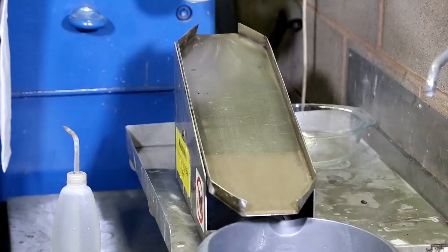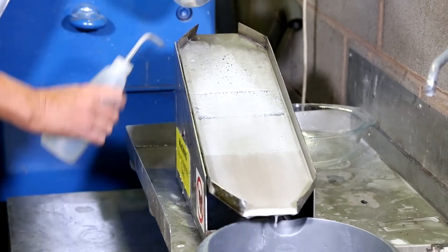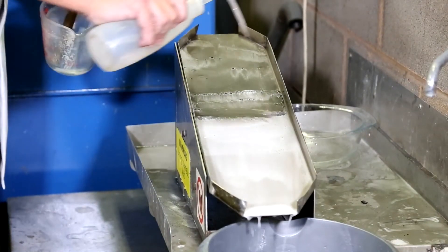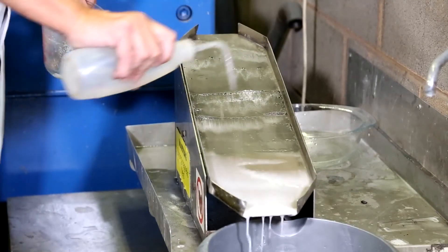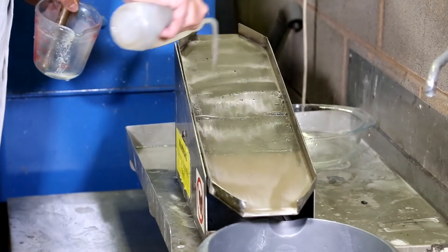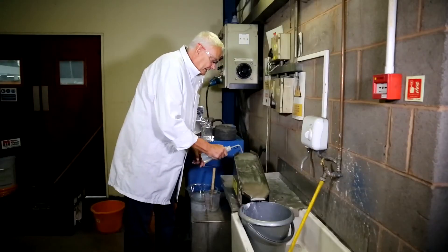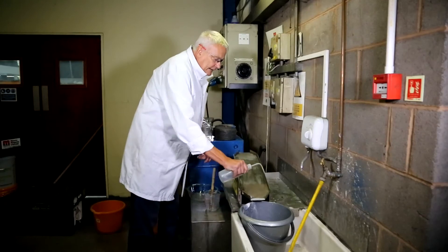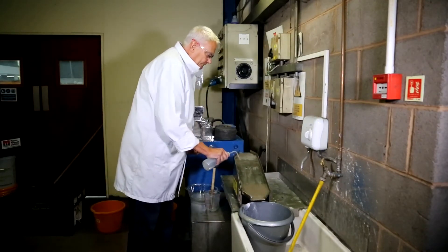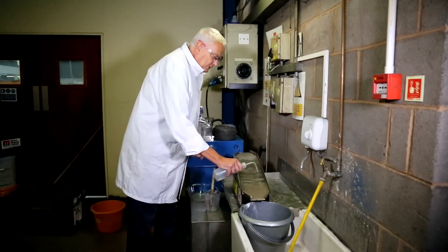We simply take our suspension, pour it quite roughly over the surface of the chute, feed it through and wash it down. And hopefully you'll see that the magnetite particles are captured on the magnet surface there. Our non-magnetics have flowed through quite easily, and we can just wash that to remove any entrained material.